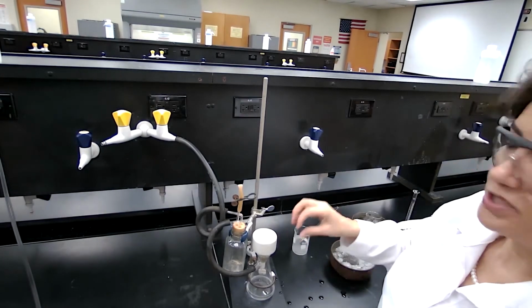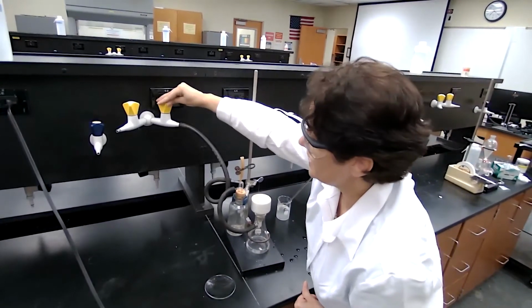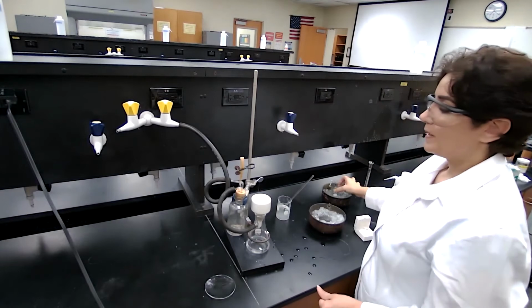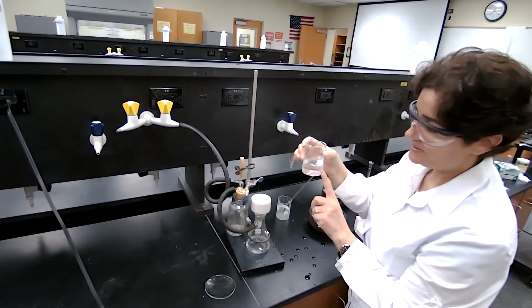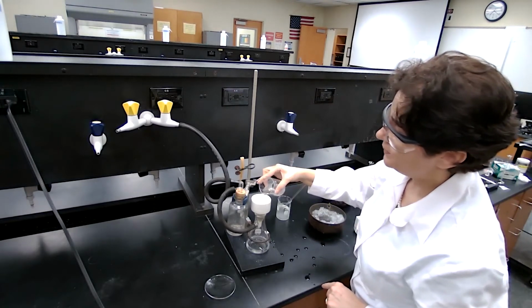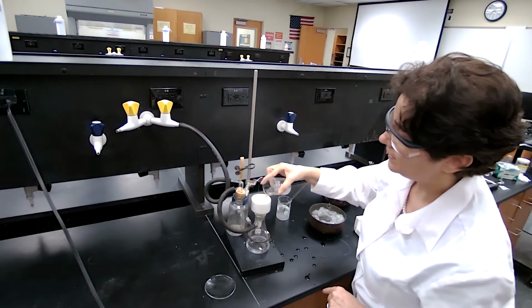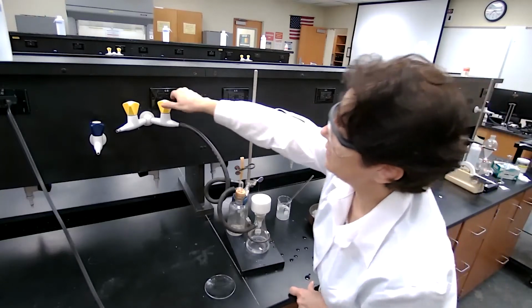For effective washing of the crystals, because these crystals need to be washed now, I would turn off the vacuum and add cold solvent, and again, it must be cold solvent so it does not redissolve. I pour the solvent over the crystals. Get the crystals soaked in the solvent, then turn on the vacuum.